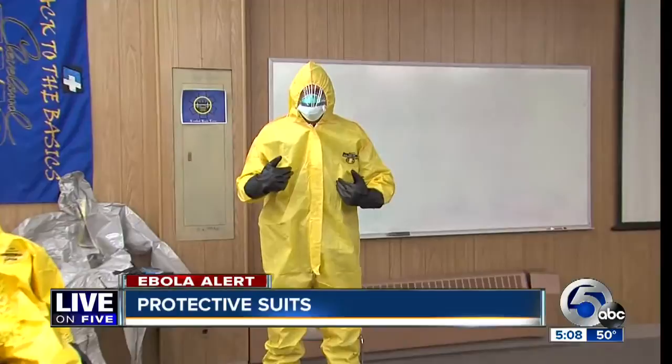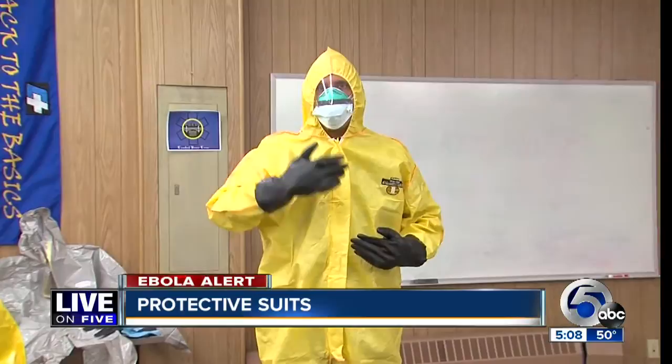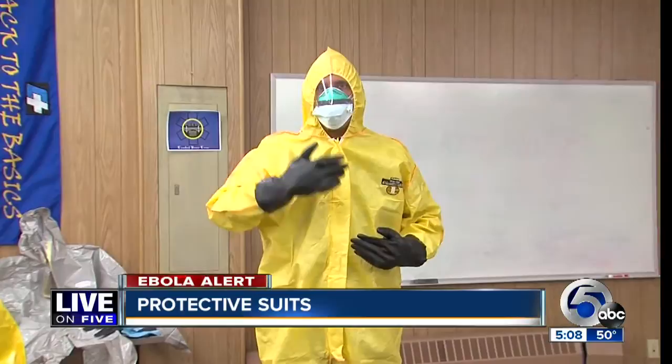You can really see that when they're taking off those gloves. Paul had a chance to experience wearing one of those suits himself — medics Nick Sayer and Chuck Kelly helped him get into one. The Cleveland EMS team helped him don the hazmat suit, minus the tape. It's a little warm in the suit, but there's free range of motion and it's actually pretty comfortable. A little warm around the mask, but he felt secure — though the mask does steam up a bit, making it a little difficult to see.